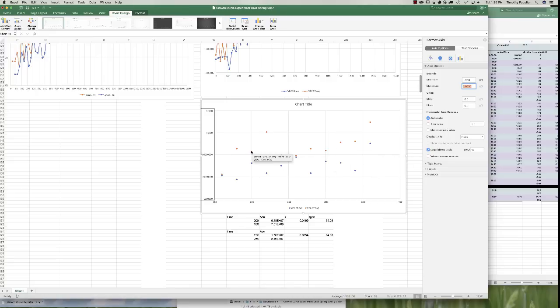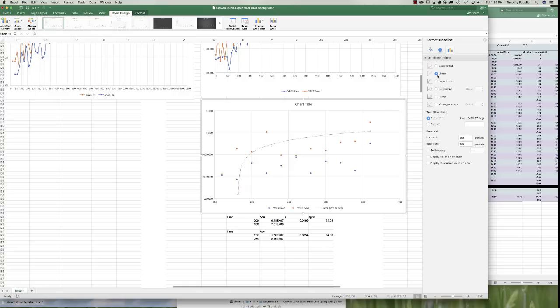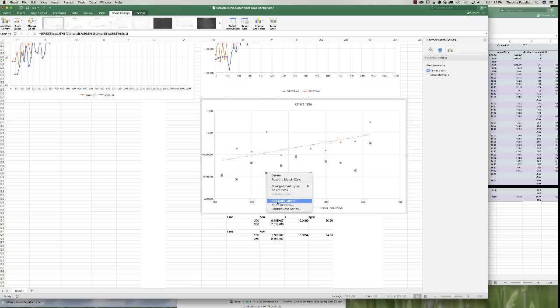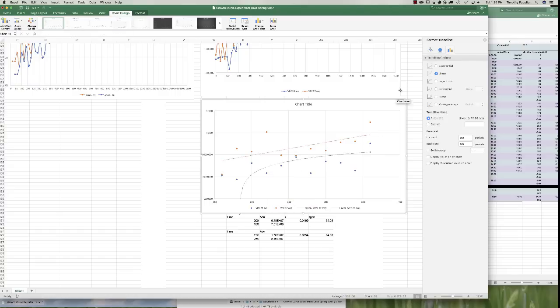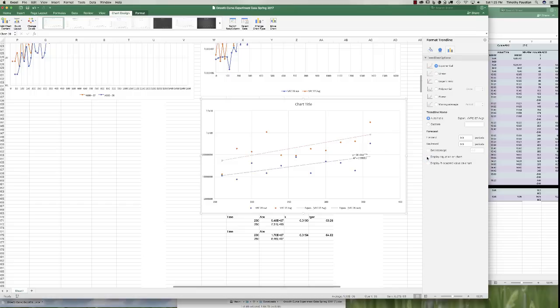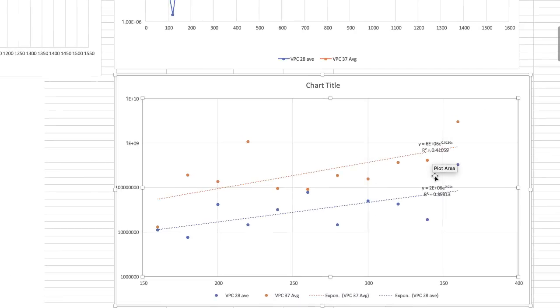To add a trend line, click on a data series and right-click to select Add Trend Line. Choose Exponential trend line. Do the same for the other series — click it, right-click, Add Trend Line, Exponential. For both trend lines, check Display Equation on Chart and Display R-Squared Value. Click on each trend line to make sure both checkboxes are selected. Now you have the two equations shown on the chart.